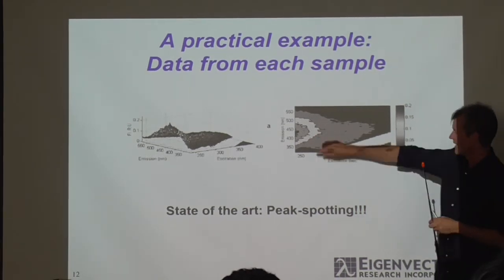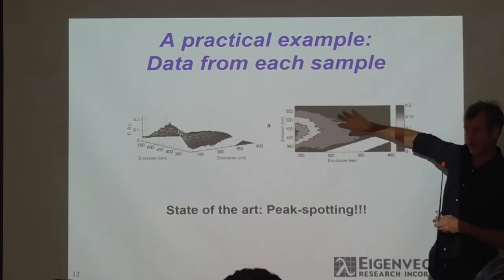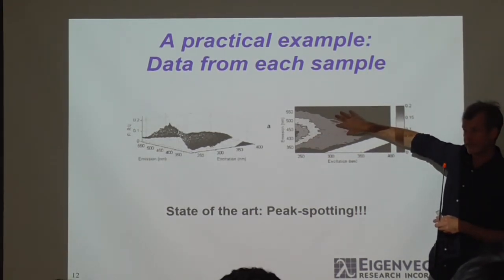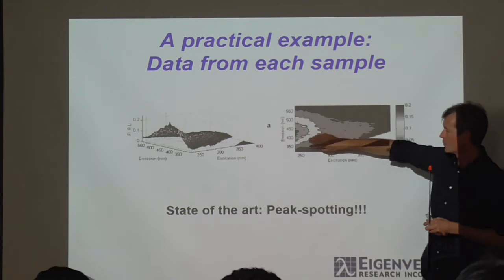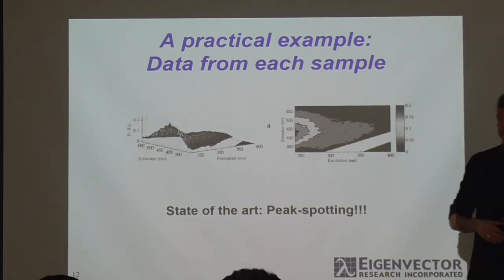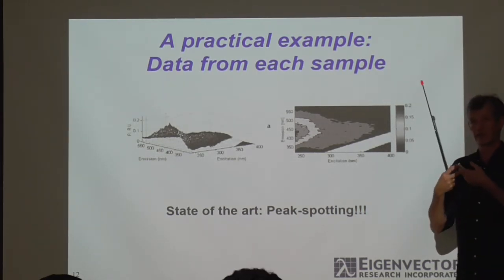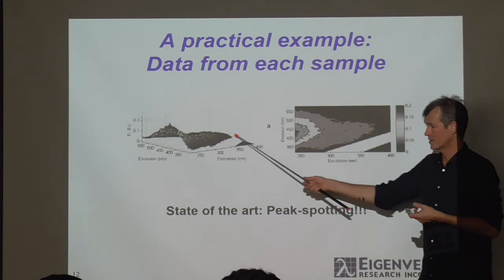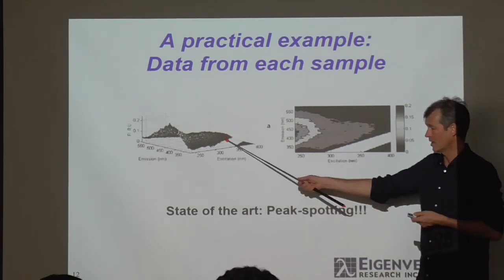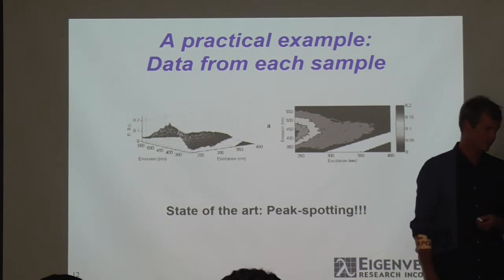And then you would say, we have something down here, so that's proteins, or up here we know that we have some NADH and things like that. So people would look in different areas and just visually interpret it. And that's not a very extensive use of this. There's a lot of information here, and there's a lot of things you're going to overlook if you only look at this visually.